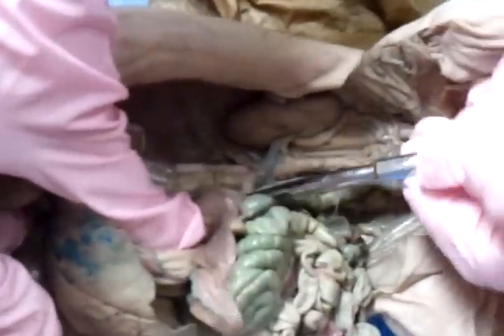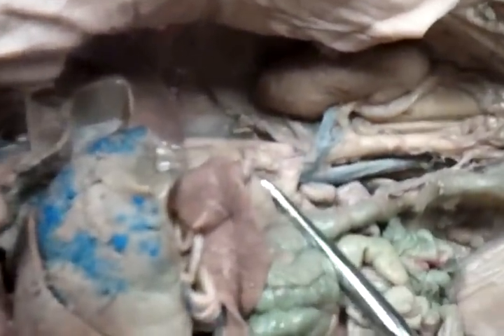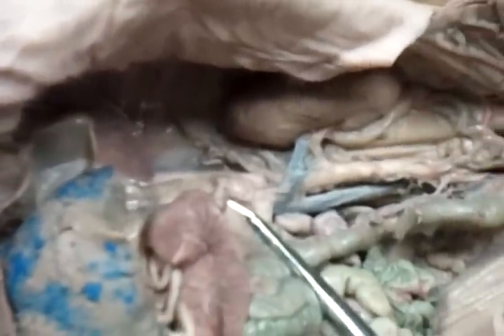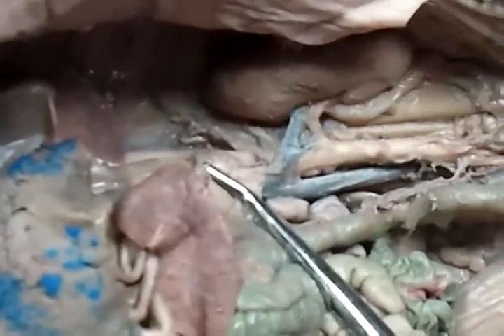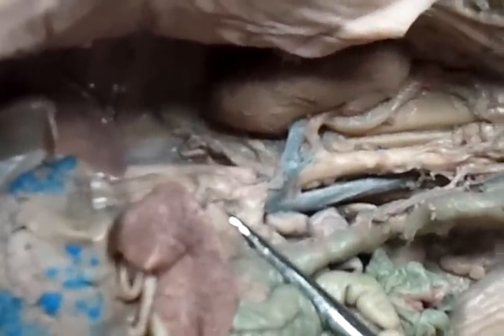This branch right here, the first one, I'm going to stick the probe under it. That first branch right there is the celiac trunk. It's a single branch. There's not a left and right. And off of the celiac trunk, you don't have to find them, but there are 3 branches. One going to the spleen, called the splenic artery. One going to the liver, called the hepatic artery. And one going to the stomach, called the gastric artery.